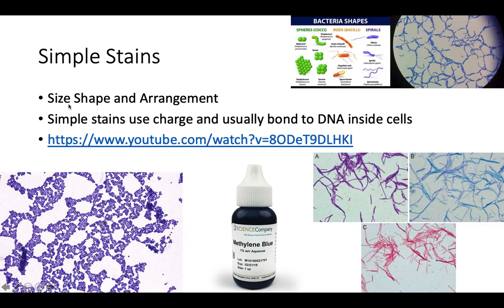So you get shape. You'll be able to see the shapes of bacteria here. There are three common shapes. You have coccus, round; rod or bacillus, which is a tic-tac sort of shape, kind of like a hot dog. You see that here. These are our cocci, the little round balls. And then spirals, which kind of look like a spiral pasta noodle or a little twisty thing underneath the microscope. So what you'll be able to see is what shape they are. Are they round? Are they rod-shaped? Or are they spiral?